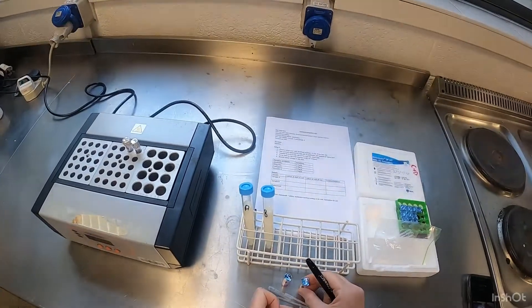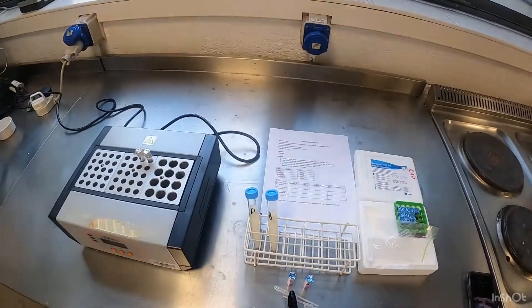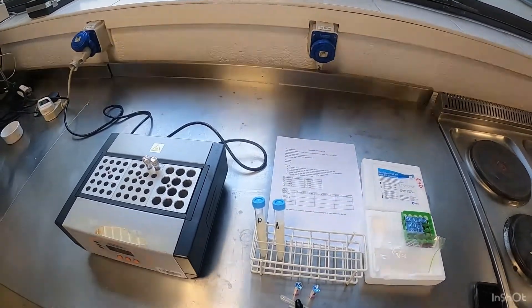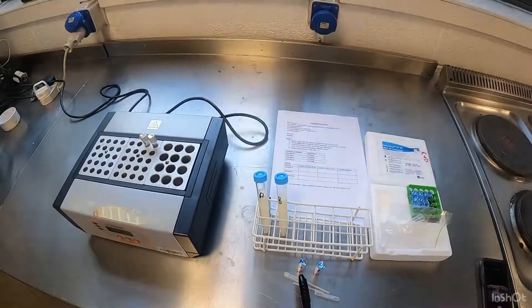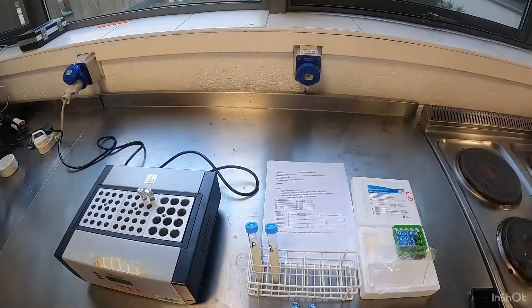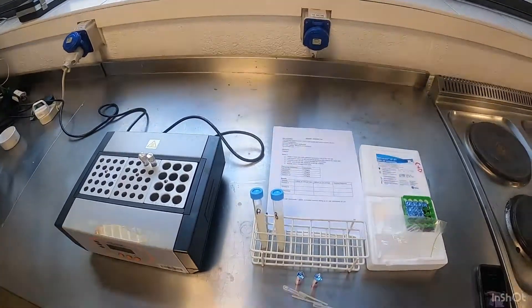In each of these ampoules there is basic nutrient, bromocresol purple, and assay organism Bacillus stearothermophilus. If you had an infection in your throat and you took an antibiotic, it will kill the bacteria.